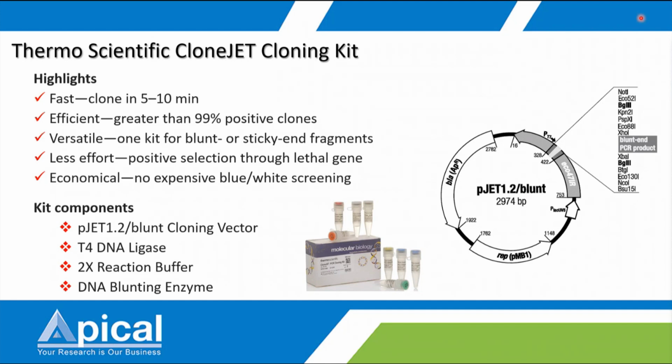It is suitable for both blunt end and sticky end cloning. There are a lot of restriction enzyme sites you can choose for your sticky end cloning, or you can do blunt end cloning also.